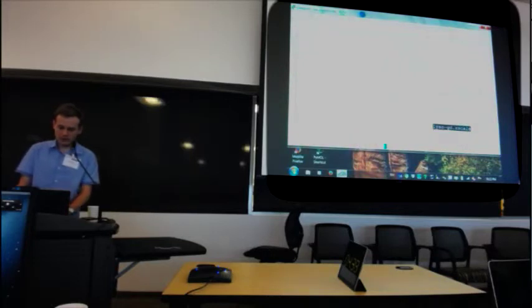We can open the XDS input file, put the input file here. Can you follow? So when I look at the source file, this out file, no. I don't see the source.